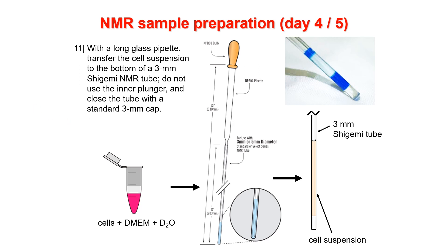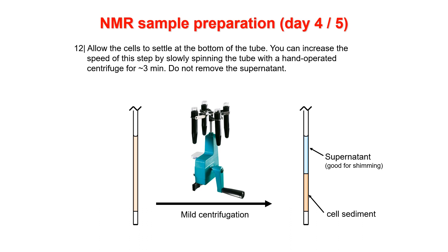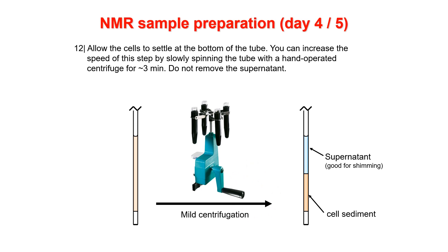The next step is to make a soft cell pellet at the bottom of the tube. This would happen anyway since the cells do not stay afloat and settle down by themselves in a few minutes, but we speed it up by spinning the tube slowly with a hand-operated centrifuge — very classic for spinning down NMR samples. In about three minutes you get a nice cell sediment with the supernatant at the top of the tube. That is why we don't use the plunger: the supernatant acts as a plunger. The pellet stays exactly where the NMR coil is in the instrument, minimizing the cell volume needed.